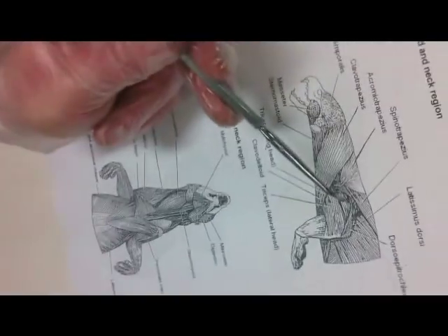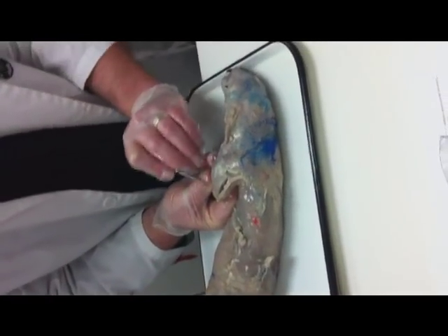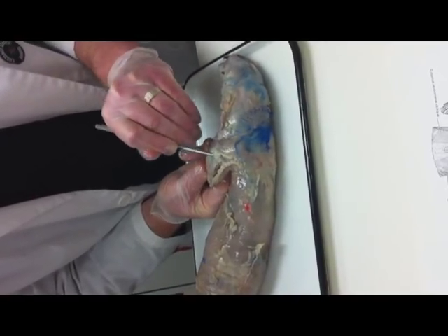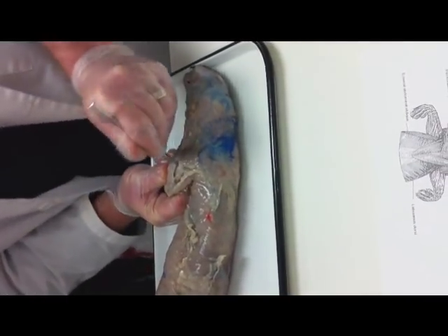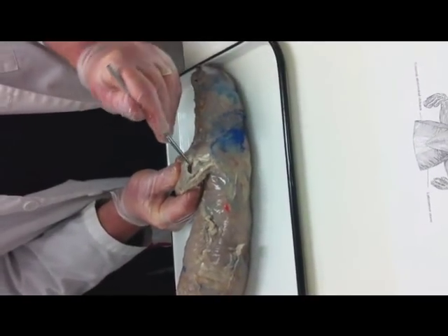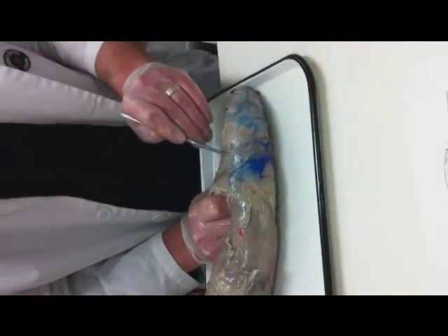In the arm itself, there's two muscles, triceps long head and triceps lateral head. So as I look, I'm pushing from underneath, and when I push, I notice that there's a division. This muscle, the lines are going this way, and this muscle, the lines are going that way. So if I probe at that murky area in between, I see that the muscle separates. Okay? And so what I've done is I've separated, so I've got my dorso epitrochlearis, my triceps long head, and my triceps lateral head. That's on the diagram.